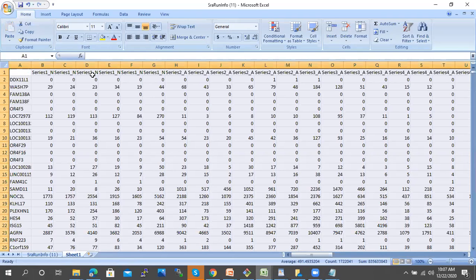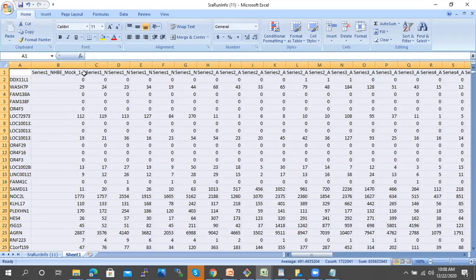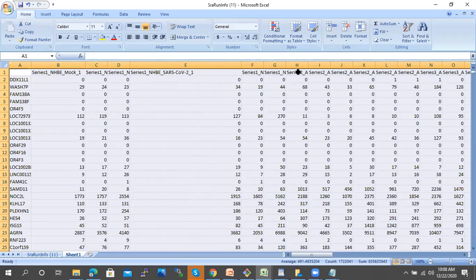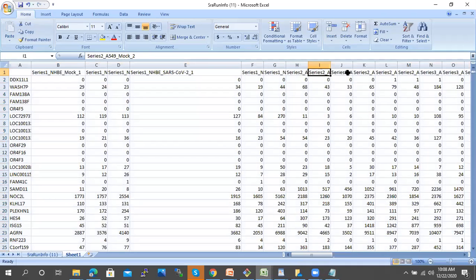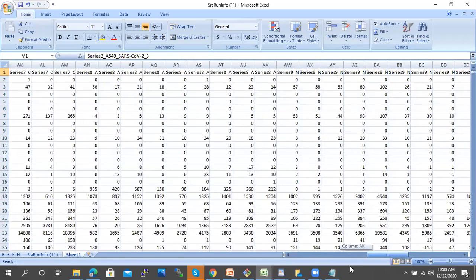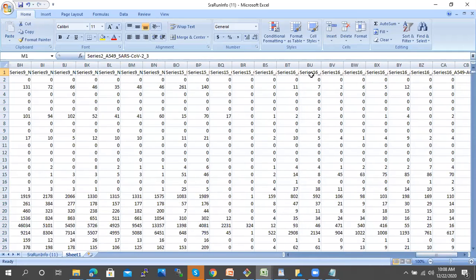If you look at this data, you will find different drug treatments. In the first, we have this particular sample, then they have also drug treated, mock samples, and then a particular drug treatment. From this I have already selected only one data set, because there are multiple drugs and I am interested in the one that contains drug-treated samples.